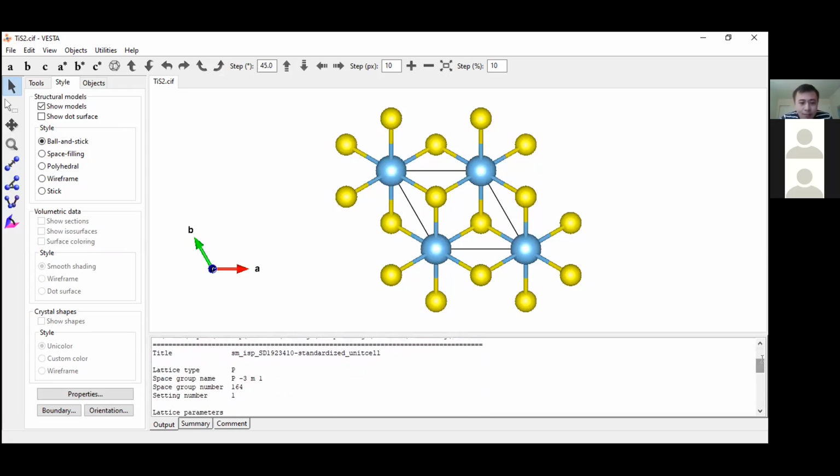And here is actually some important information about the structure. So we see this is a P-type lattice. You still remember our previous lectures, we talked about the different types of lattice, right? We can have the P, which is primitive, where we only have points on the lattice points. And then we can also have the base center, for example, like a C.